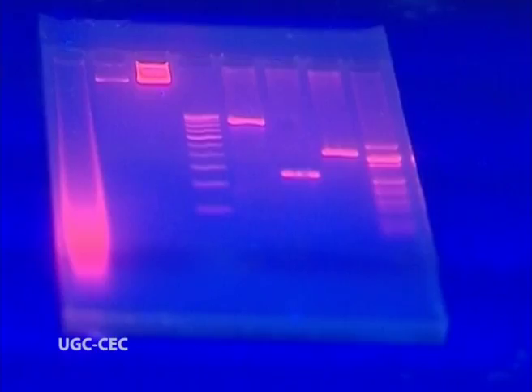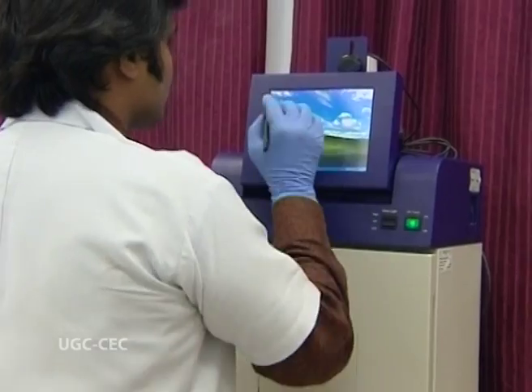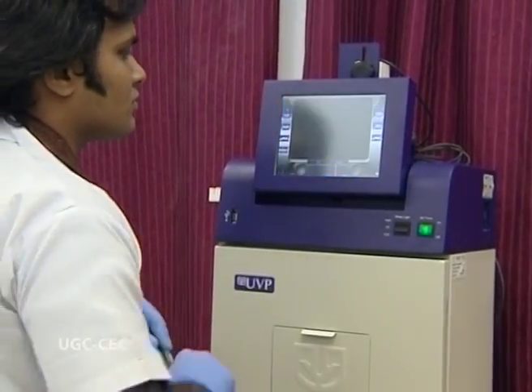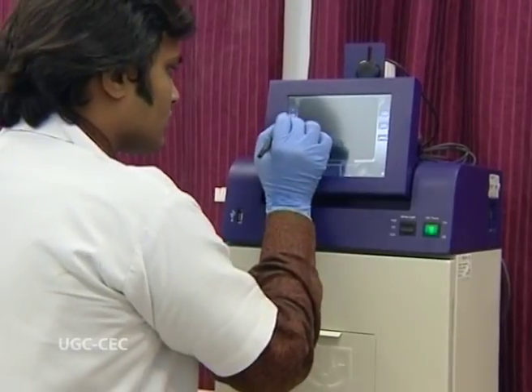There are two ways of interpretation. The reading can be made on a transilluminator, that's a device which is made up of UV, and the other one is a gel doc. It is a more sophisticated one and is helpful in research purposes. It gives a black and white picture.